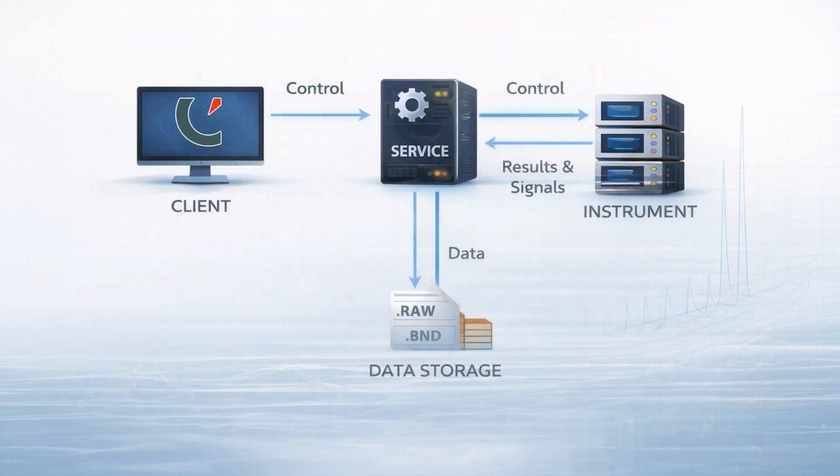If the service is stopped, instrument communication and data acquisition will not occur. The service does not need to run on the local PC and can be connected to any client on the network. We will cover this a little more later.